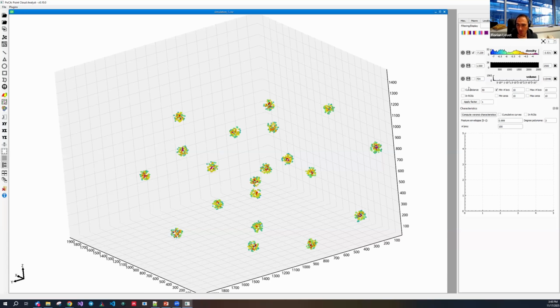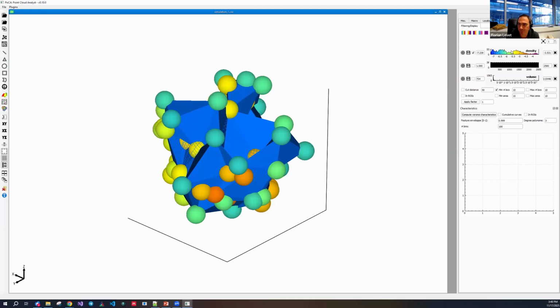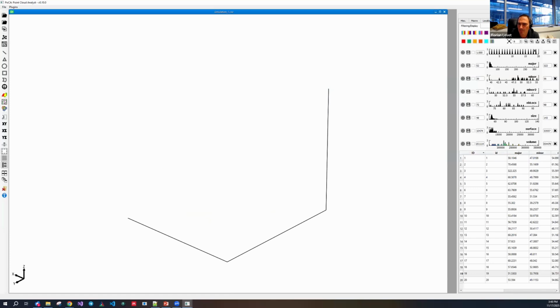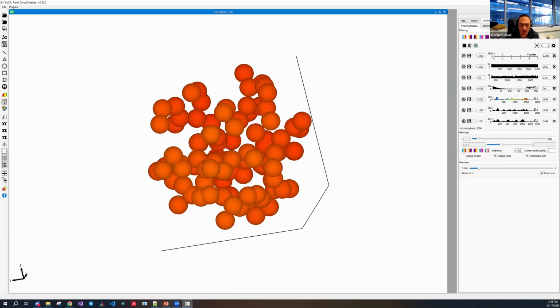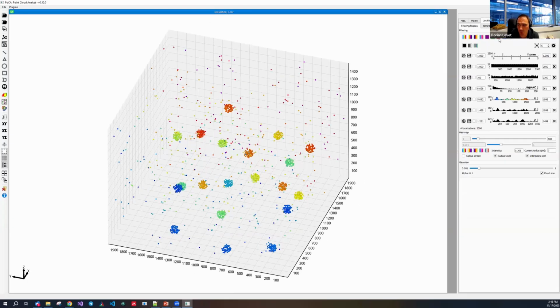You can also still use the cutting distance. Under the hood, you know the direct neighbors, so you can compute the distance between the direct neighbors, and then you can use the cutting distance if you want, as for the Delaunay triangulation. But in this case, I just apply the factor, and now I can create new objects and have this kind of result. So this is for Delaunay triangulation or the Voronoi diagram.